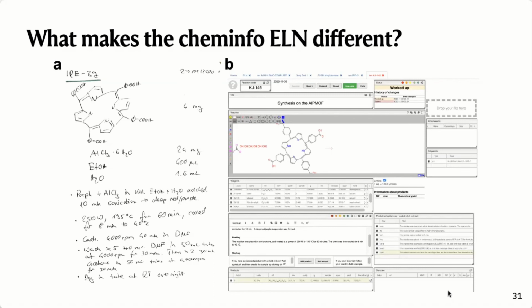So if you use the microwave, you can just start typing M and then tab complete, and it will fill in a sentence for you with some empty fields, which might be a temperature and a temperature ramp. If you fill those in, we extract them directly on the fly and attach them to a schema, and it's searchable in the database. In this way, we try to bridge having the text in there, but also having the important parts in a table that's searchable in the end.